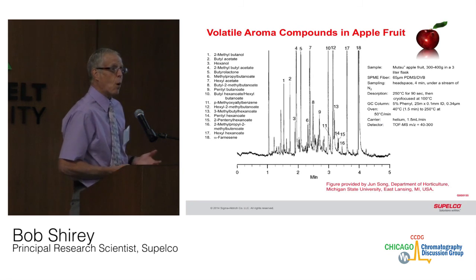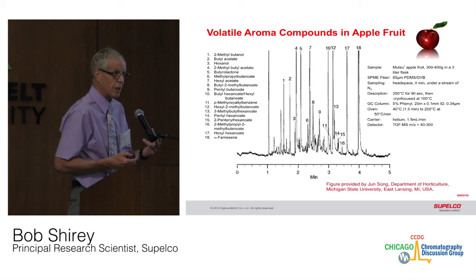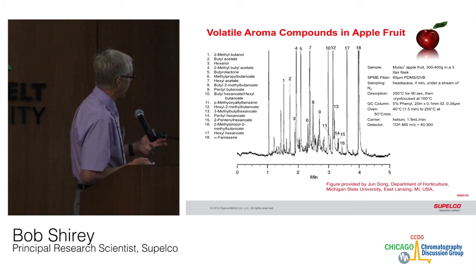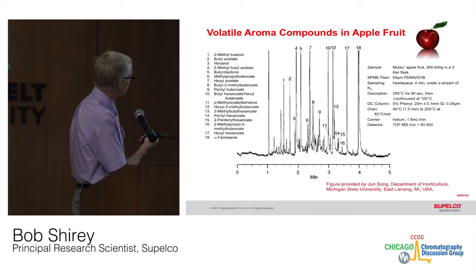If you cut up an apple and try to do an analysis, the apple's going to oxidize immediately, and you're not going to get the true flavor components. In this case, they had a jar purging with nitrogen. They cut the apple, put it in the jar, and then passed the gas stream over the fiber, and you could see it picked up these flavor components very nicely.